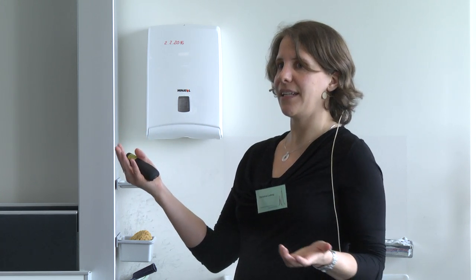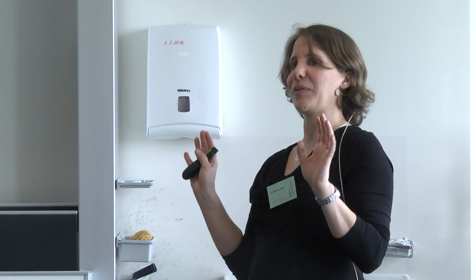That's the slide that I showed you. You're very efficient, you have a high transmission efficiency, and you're very good at reducing noise. And this is why the triple quadrupole instruments have this wide dynamic quantification range. There are also publications that show a very wide dynamic quantification range on an Orbitrap, on a Q Exactive. I am not the expert, I don't want to compare all of those, but I think SRM is one of the most sensitive techniques you have in hand, and often this is why you can measure the least abundant proteins with SRM, which you cannot get on an Orbitrap in PRM mode or shotgun.